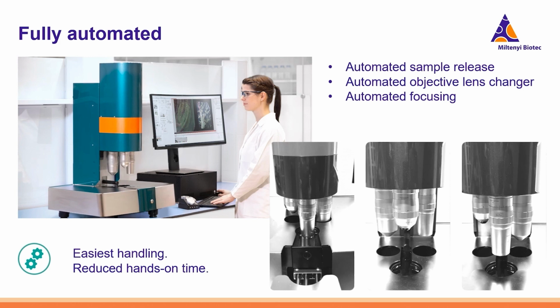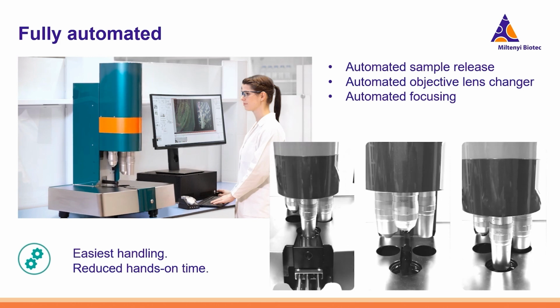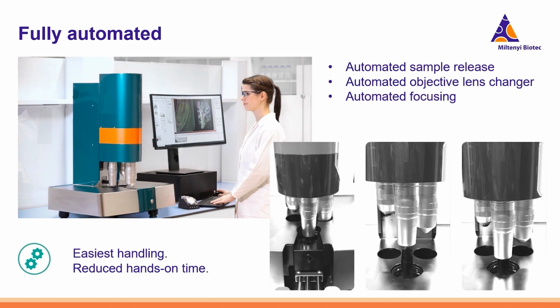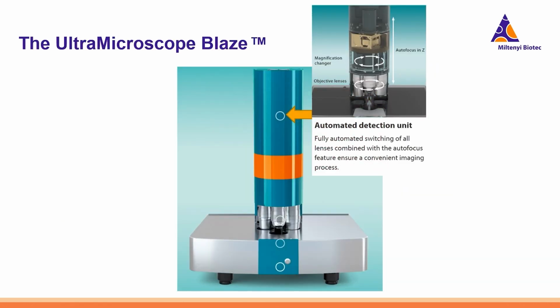And then we have the automated focusing feature. There are no coarse or fine adjustment knobs. Focusing in on your sample is accomplished with just a click of the button in the software. Much of this automation is conducted through the automated detection unit, which is controlled completely through the software.